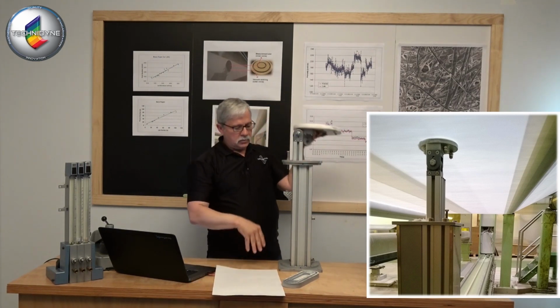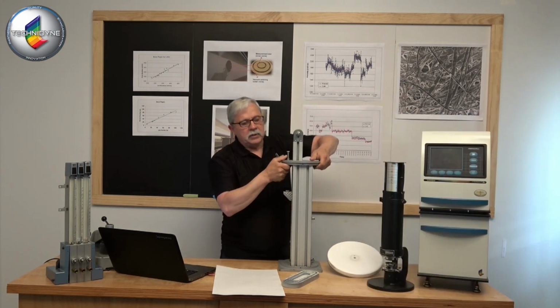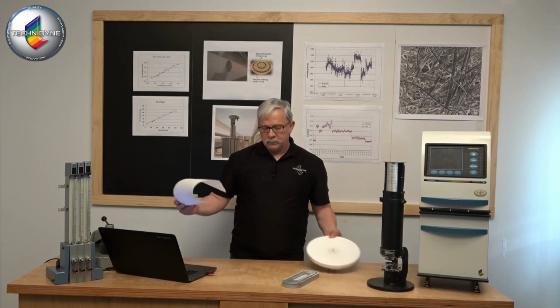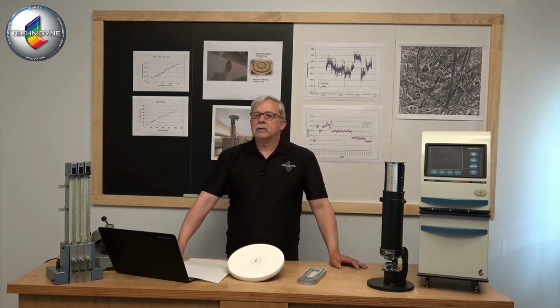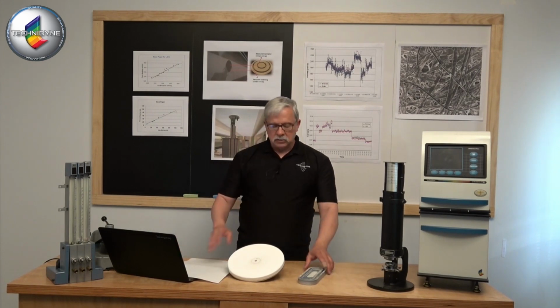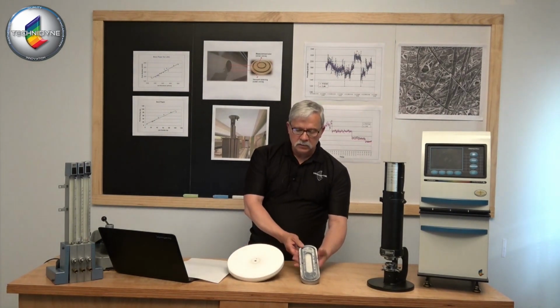And then we do some other tricks. In other videos, we talked about some similarities between the different methods. One of them being we need some means of clamping or fixing the measurement area that we're testing. In this particular system, we have a number of different types of measurement heads that we can utilize.